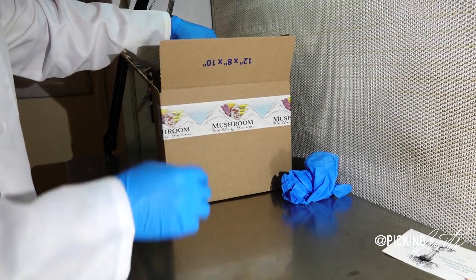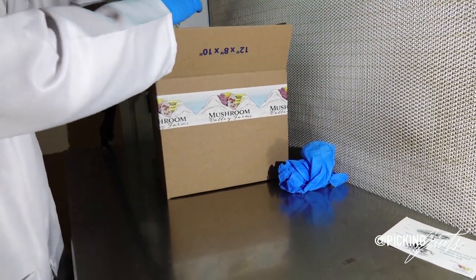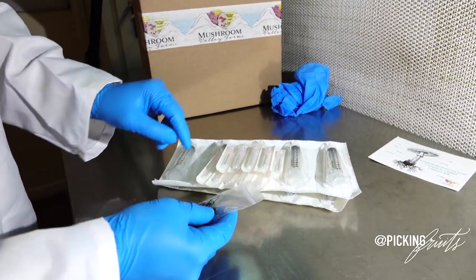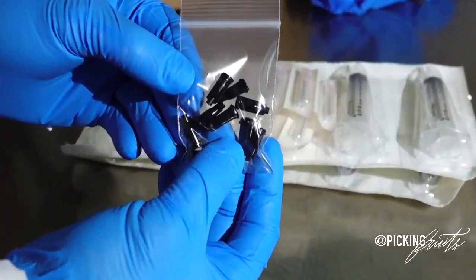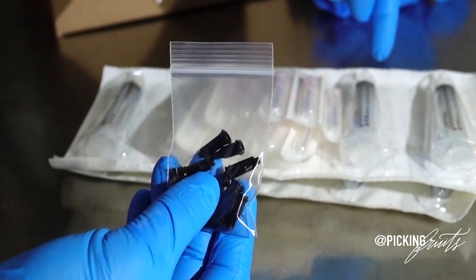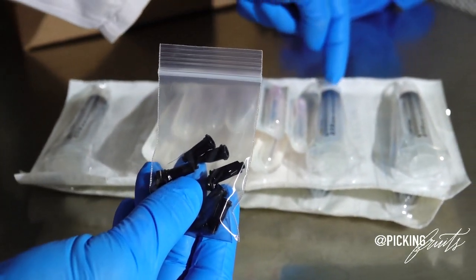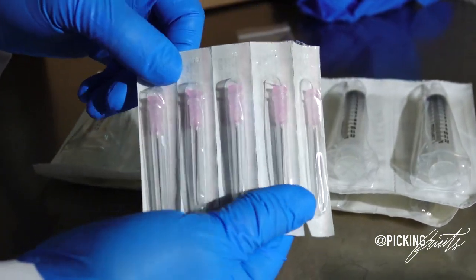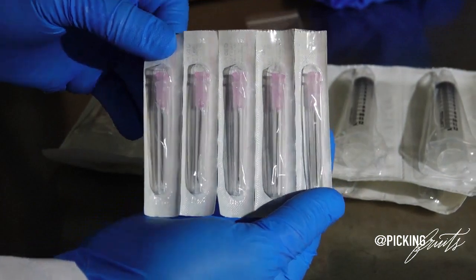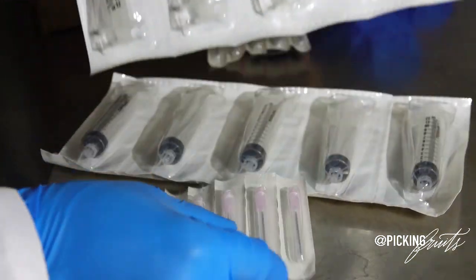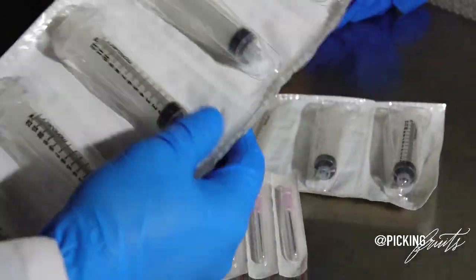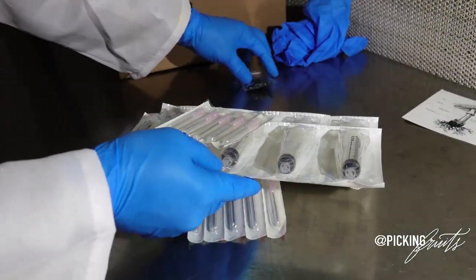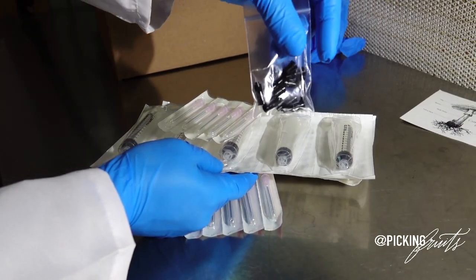The next thing you will find inside of the box will be 10 sets of complete syringes with luer locks. So here are 10 luer locks. These luer locks will be used to cover your liquid culture syringe so that your media is safe. Here are 10 luer locked 18 gauge needles, and 10 12ml luer lock syringes. All of these are sterile except for the luer locks but you can easily sanitize these.